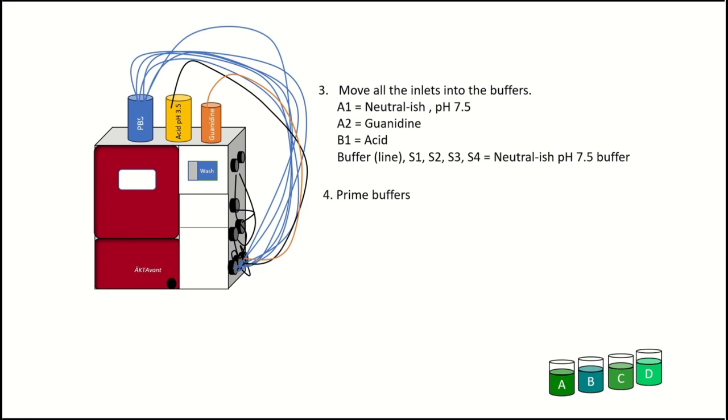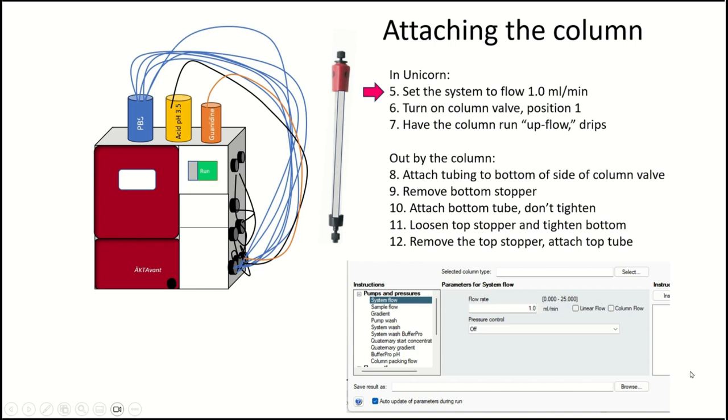We're leaving our antibody samples aside for a little while here too. Okay. So there are a lot of ways we can do this. We could have attached the column before we actually started priming all the buffers and everything. It really depends on your personal preference, the kinds of buffers you're using, the column you're using. Maybe that's a bad idea. Maybe that's a good idea to put all your buffers and get your system running with buffers first. So in this case, I am attaching the column after I have all the buffers primed.